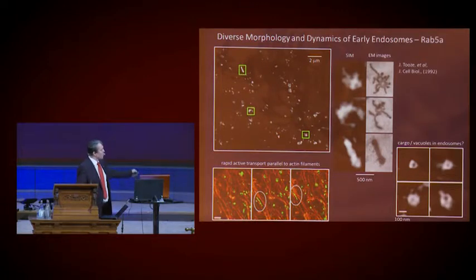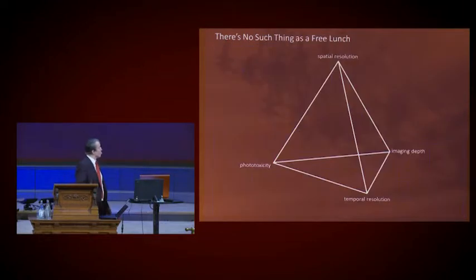And for example, these little protrusions are bits of membrane that will eventually recycle back to the plasma membrane. And furthermore, we can see in these endosomes that there's little dark holes often, which probably represent either a cargo or vacuole inside of them. And oftentimes you'll see them, normally they diffuse sort of randomly in the membrane, sort of constrained by the actin, but then next to but not on the actin, you'll see whoop, one go just real fast out of the way, and that's probably microtubule active transport of these early endosomes.